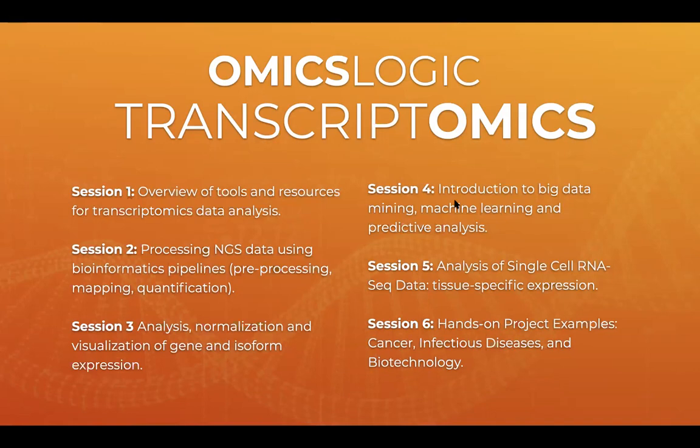Okay, so then we talked about single cell RNA-seq, and I saw that some of you ran a pipeline. I saw that some of you also ran the pipeline incorrectly. So remember that whenever you have a pipeline of single cell RNA-seq, you have two files. You have the barcode for a sample, and you have the sample itself. So that's just an important thing to keep in mind.